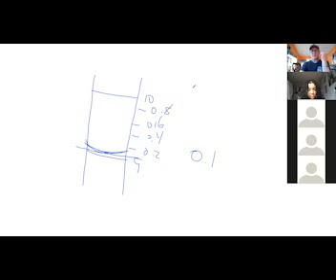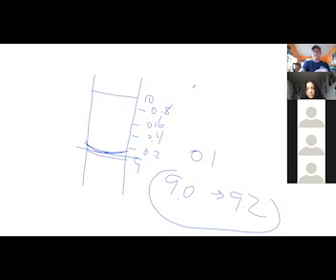So I would say if that was right there, my interval is probably between 9 and 9.2. Usually my interval is either the difference between those two tick marks or slightly less than that. If there's a big difference between them, I could probably say it might even be half of that. But this is a pretty good indication of what my interval would be.